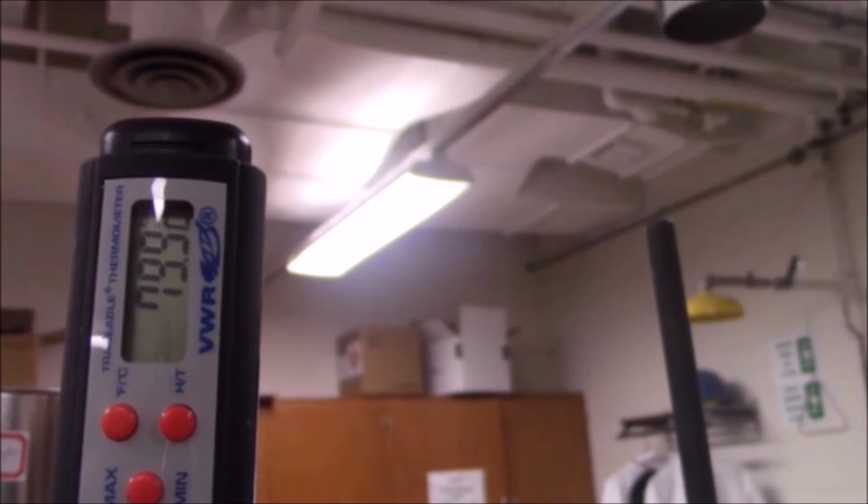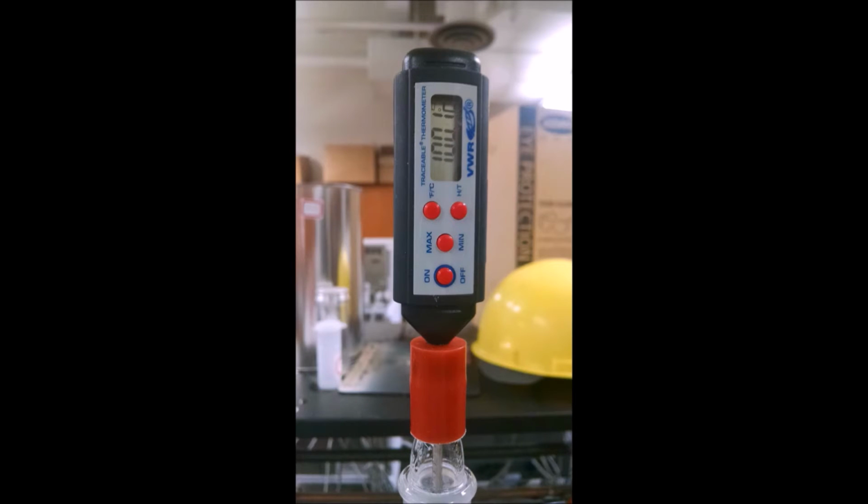Temperatures of both the boiling liquid and the condensing vapor should be monitored at regular intervals, such as every minute. This information will help with assessing percent ethanol in the product. For reference, the boiling point of ethanol is 78.4 degrees Celsius, while the boiling point of water is 100 degrees Celsius.